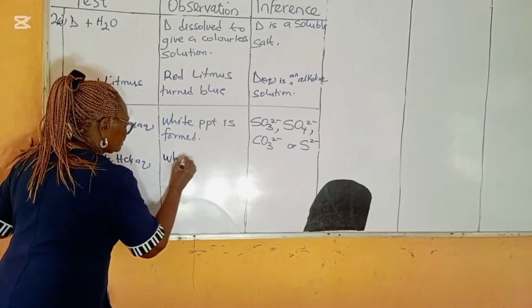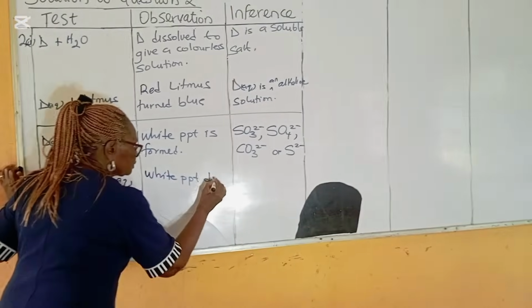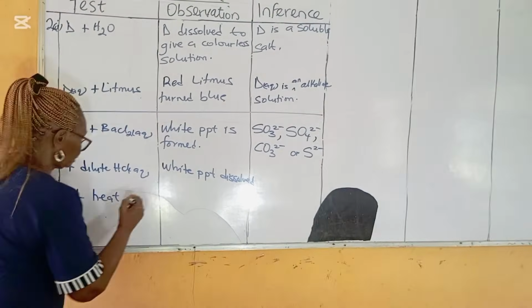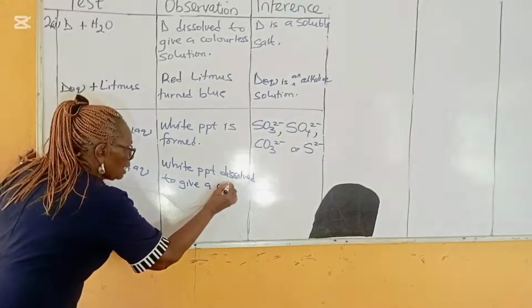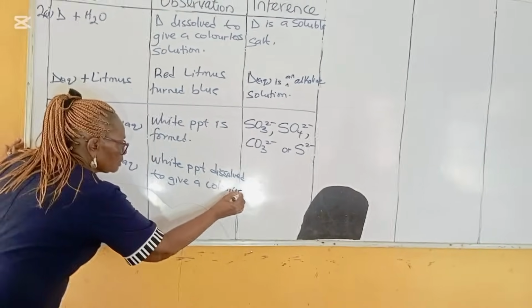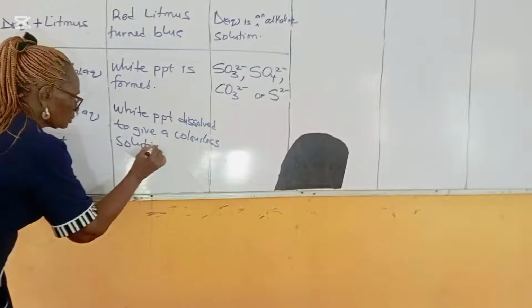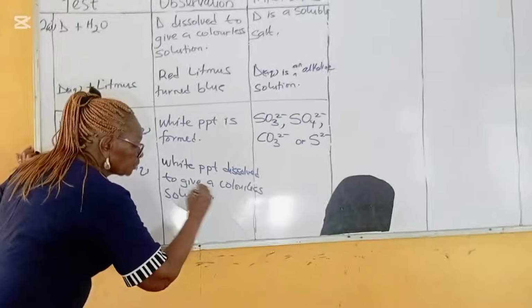White PPT dissolved to give a colorless solution on heating, of course.